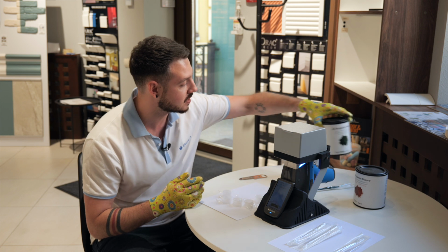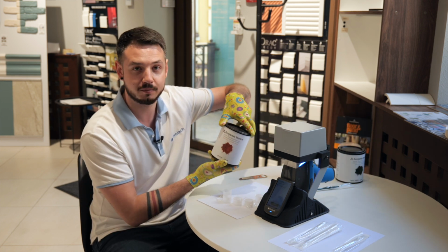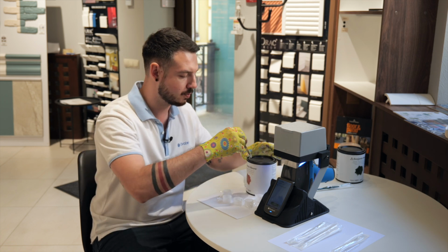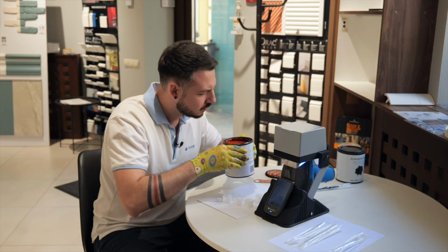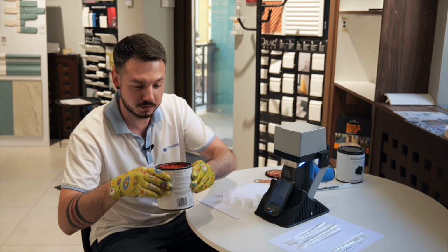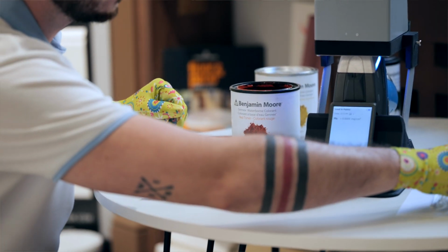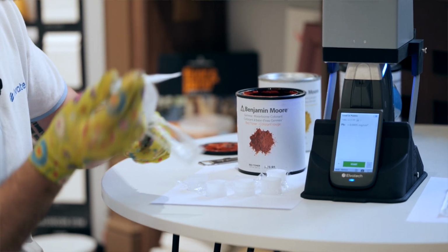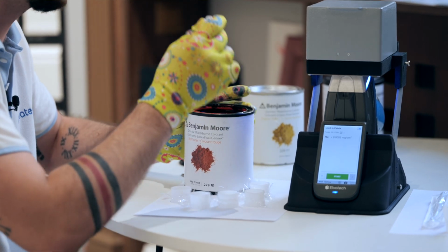Let's move on to the second one, where we're gonna measure red toner, this kind of paint. So we need to perform almost the same procedure. Just open it up. Yeah, and this color is also really cool and grounded. Just look at it. Great. So we're doing the same procedure here. Just taking a pipette and gonna pour some paint in our sample cups.